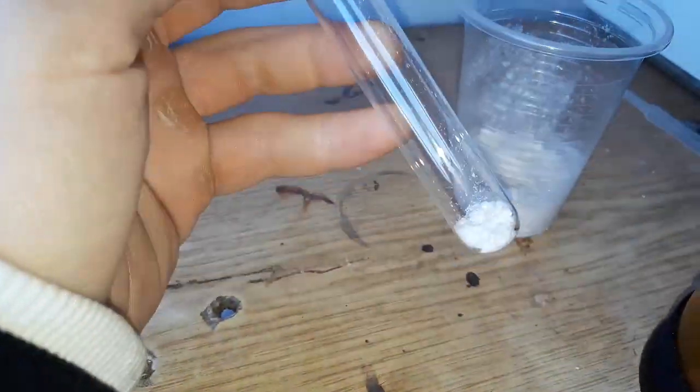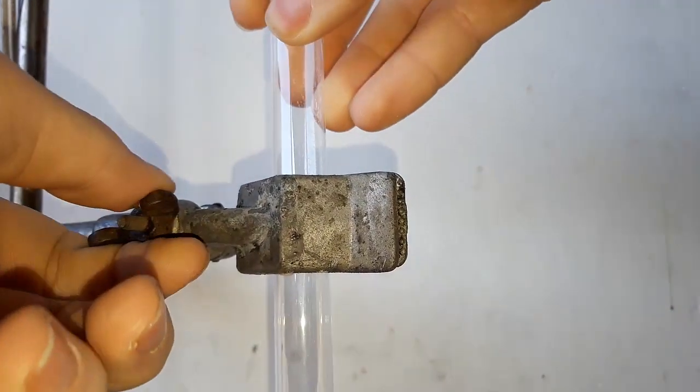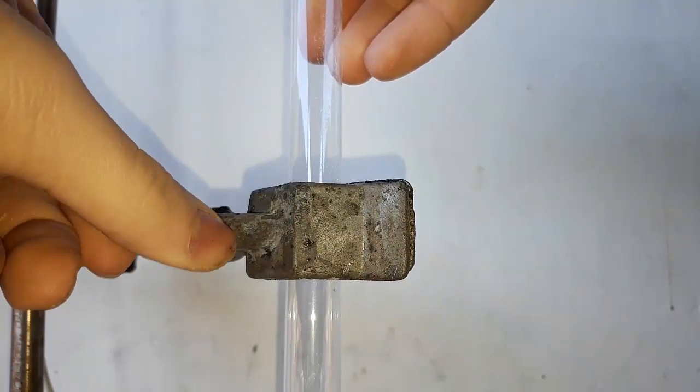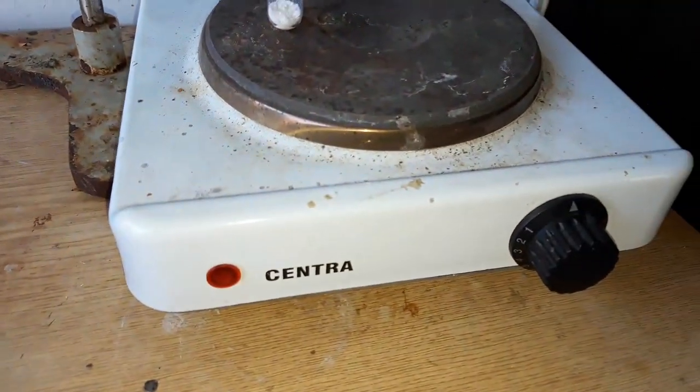The easiest way to determine if we actually made salicylamide is to check the melting point. We take a test tube, fill it with a bit of our pure product, put it on the hot plate, and insert a thermometer. Then we gradually heat up everything until it starts to melt.